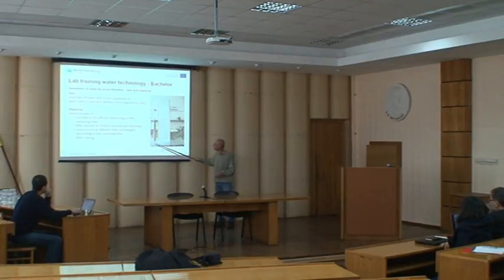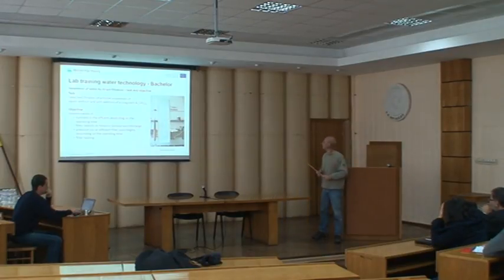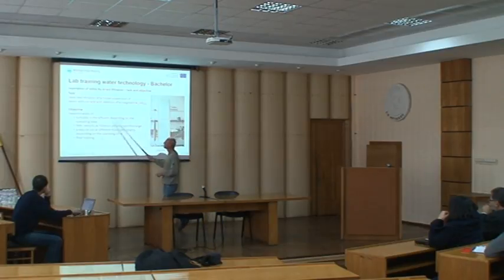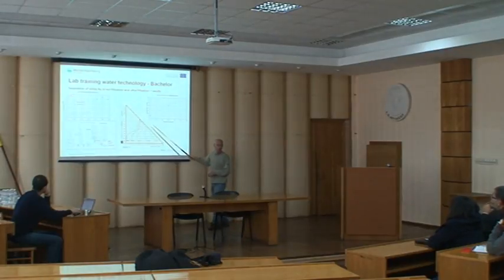We can rinse it with water from the bottom to the top, and the material will not be mixed because of the different densities. So turbidity in the effluent, the pressure loss over the time, and the filter loading have to be determined. To the next, please. And here you see the Michaud diagram. I think you're familiar with that, the pressure loss at certain heights.